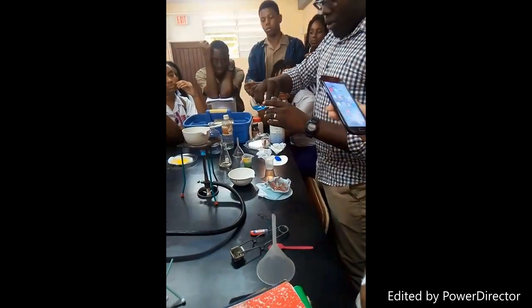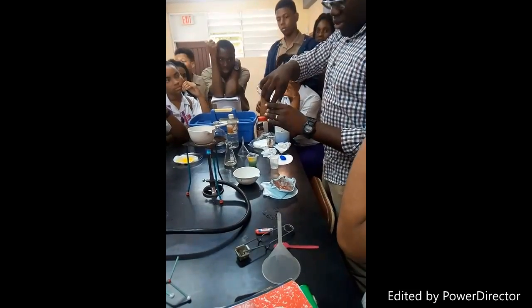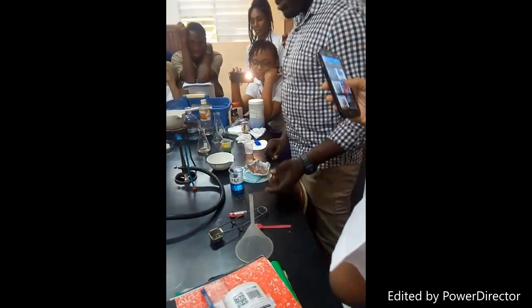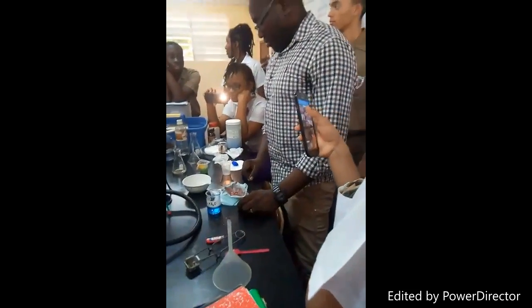I'm going to boil this down, concentrate it, and leave it for Monday. So when you come on Monday, you'll see it. We don't have it last Tuesday. Okay, Tuesday. That doesn't mean you can't come on Monday. I'll be here. I'm always here.